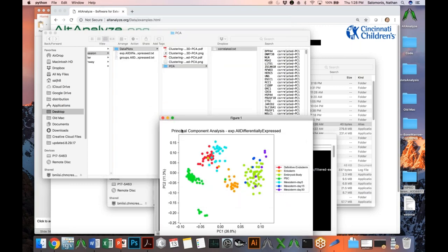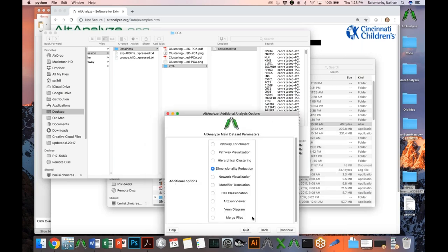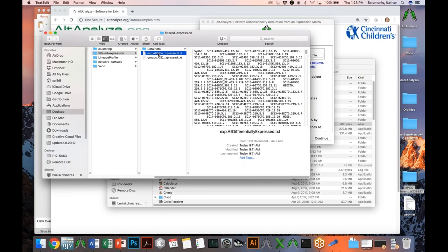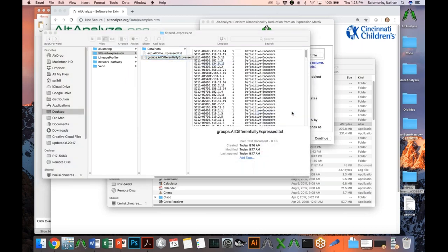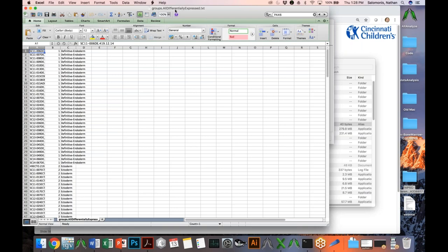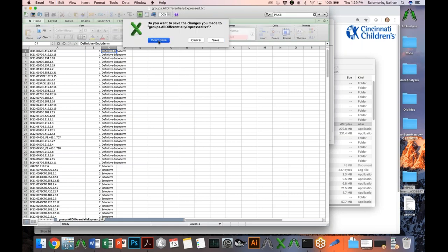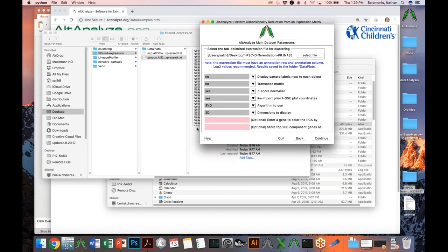You can also interactively view expression of individual genes on the PCA plot. For example, typing OCT4 or POU5F1 will re-render the plot showing a gradient of gene expression, where the darkest red indicates the highest expression of OCT4 and gray indicates no expression. You can also enter multiple lineage markers — for example, Nodal for endoderm, Pax6 for ectoderm, and GATA4 for mesoderm — and the plot will show which cells are maximally distinguished by expression of these different genes. This is a nice way to mark cell population identities even if these were single cell RNA-seq profiles, if you have a priori identified cell markers.